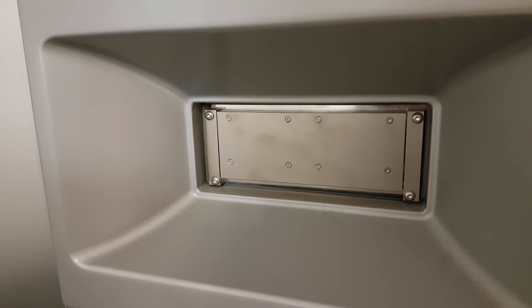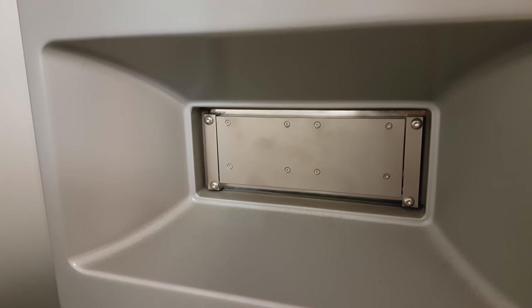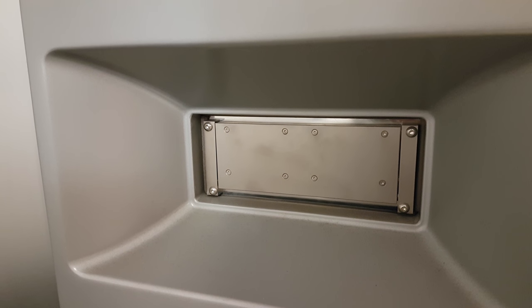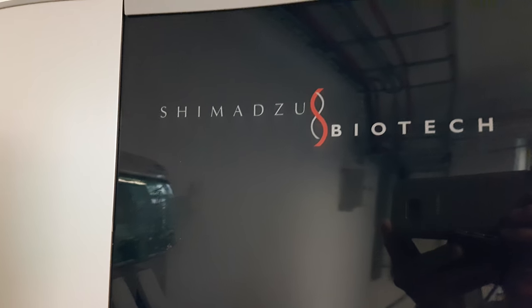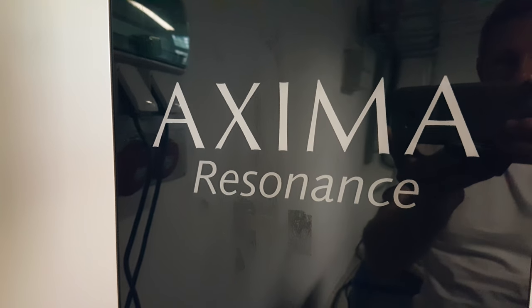This is the port from which and into which you place the sample — there's an airlock. This is the actual Shimadzu Biotech Axima Resonance.